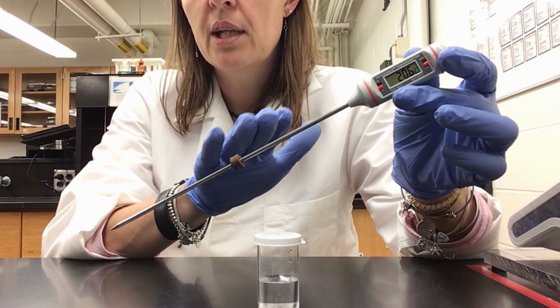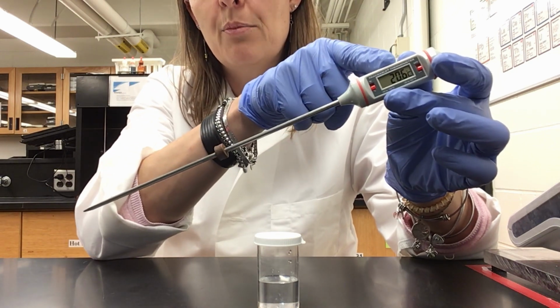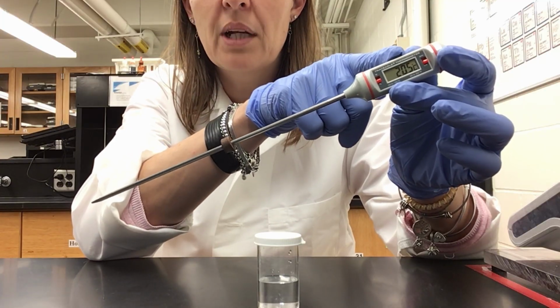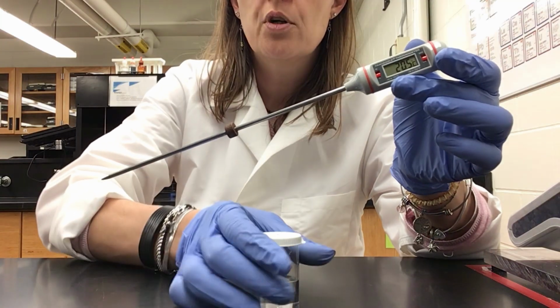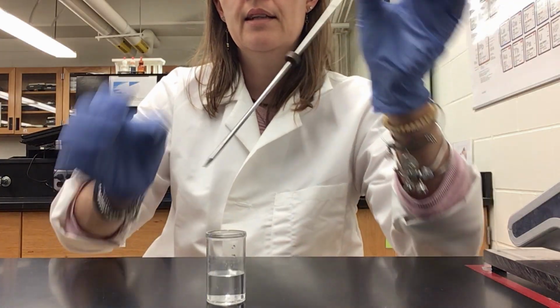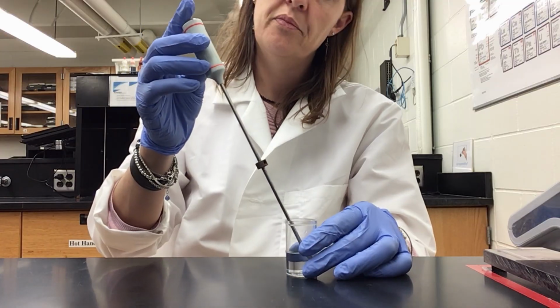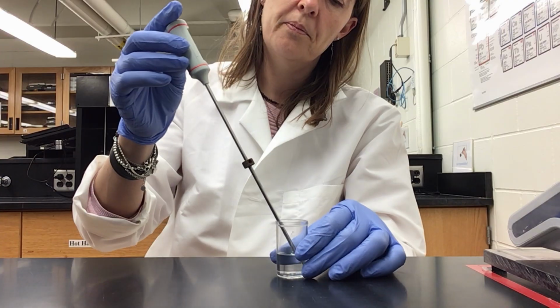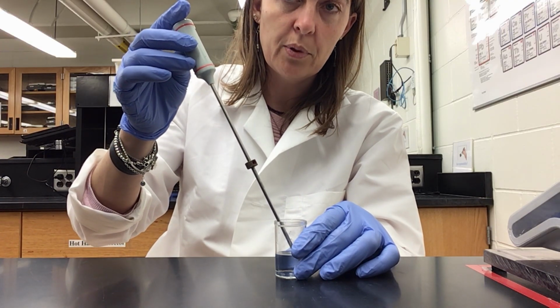So I already calibrated this, and this works just fine. As you can see, the reading of the temperature of the room has been stabilized. Now it's 20 degrees, 0.5. So now I'm gonna take my water sample, and I am going to put the thermometer right here, and I am going to read the temperature of my water, which is exactly room temperature.